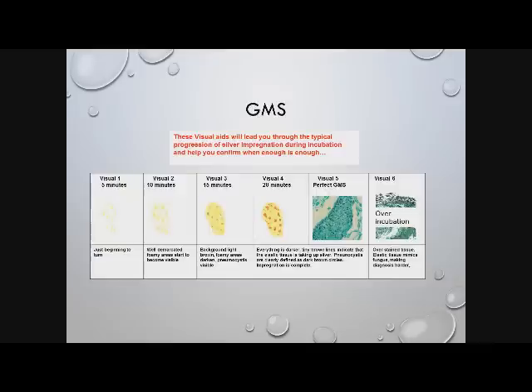And then after about 20 minutes, things get darker. You get the tiny brown lines that indicate your elastic tissue is starting to take up silver. So you might want to stop it. The Pneumocystis are clearly defined. So when you stop it there and perform the rest of the stain, visual 5 is kind of what you end up with, a perfect GMS and not over-incubated.